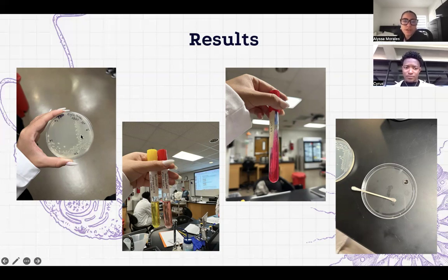Then, using parts of this culture, excreting some of this bacterial colony, we would test in the second photo our glucose test, our lactose fermentation test, our KIA test on this slant, and ultimately our oxidase tests. In the upcoming slides, you'll see what these results mean.